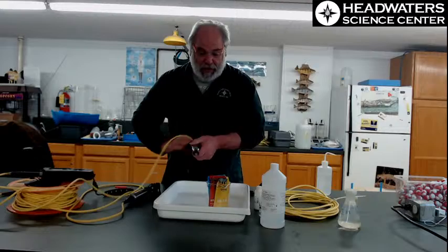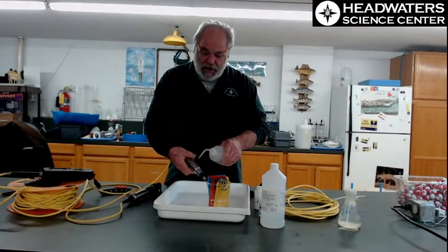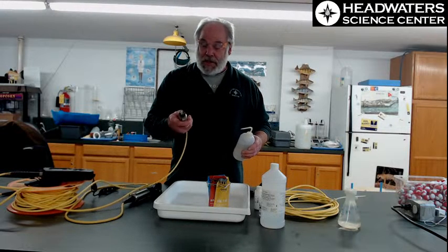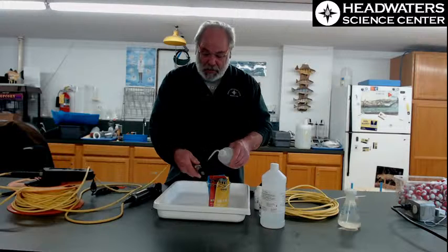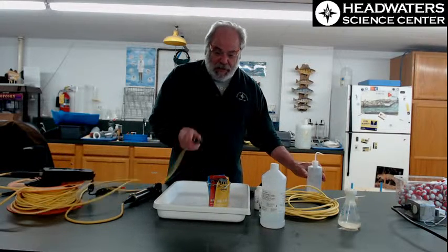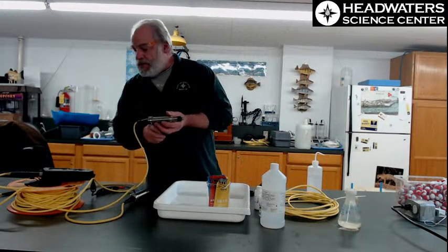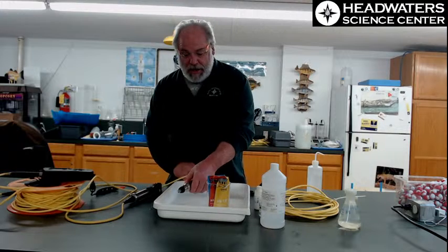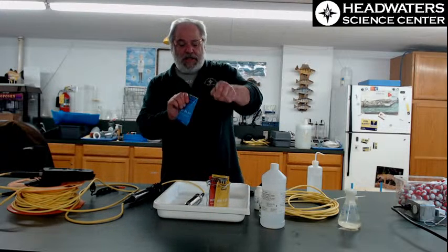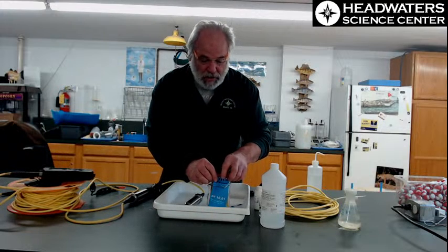All right, so I'm going to clear it again, get it rinsed well. Sometimes I even put that under the sink first, the tap water, and then I do this to rinse the tap water off, because the water itself can interfere with our calibration. Let's move it to the final one, which is the 10, and usually by the time I get to the final calibration, it can find itself close to where the standard is.